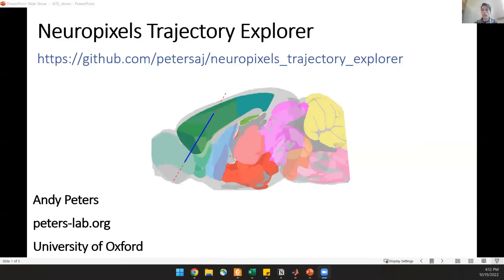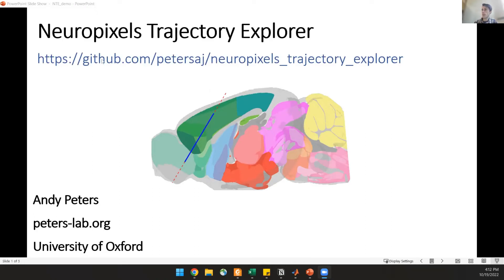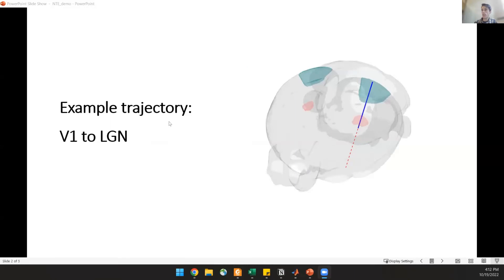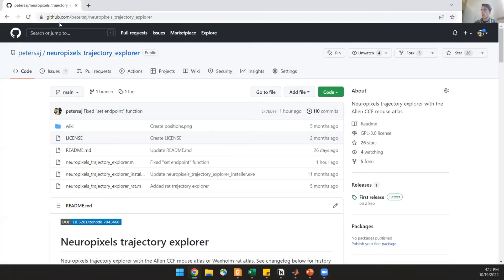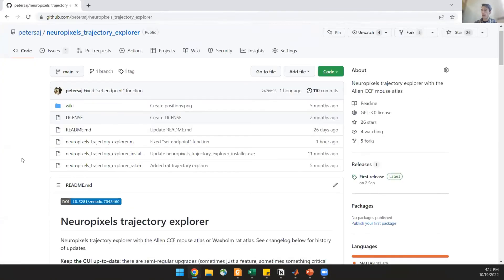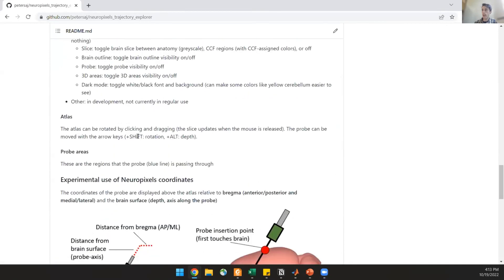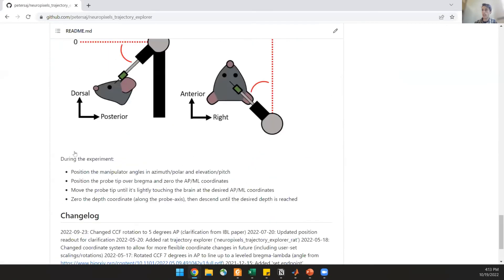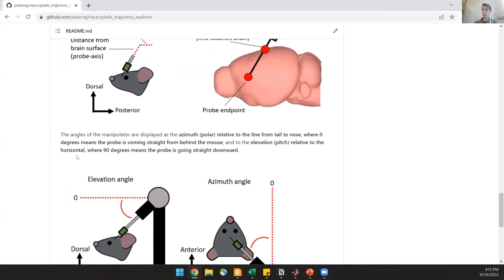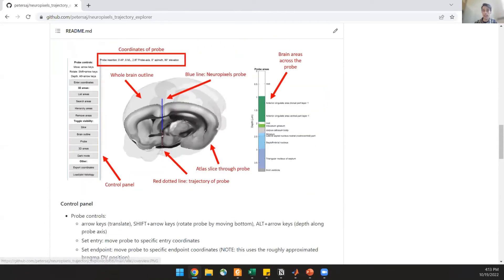So I'm going to share my screen and then talk to you a little bit about Neuropixel's Trajectory Explorer. So this one was in MATLAB because I'm a MATLAB heavy user. So if you don't have MATLAB, there is a standalone version available, but it's not kept up as much as you should be. This tool is kept on my GitHub repo, which is shown here, and it's also in the Slack group that you can find online. So today I'll just take you through a very simple demonstration of planning trajectory between V1 and LGN simultaneously.